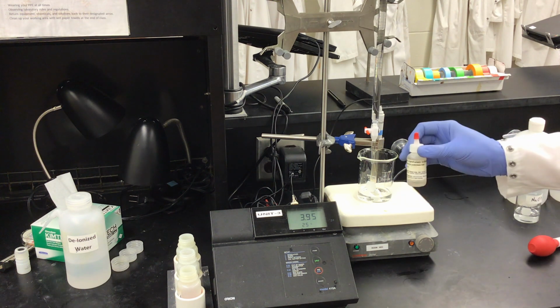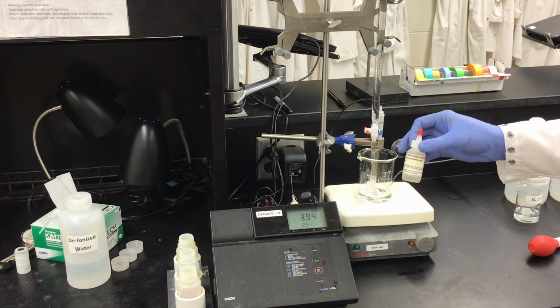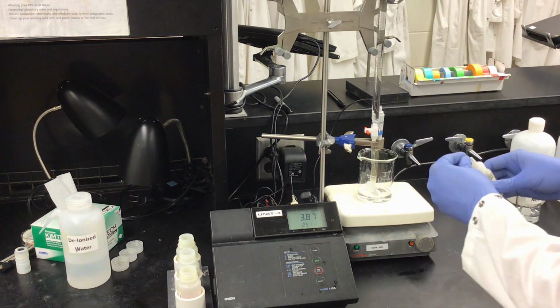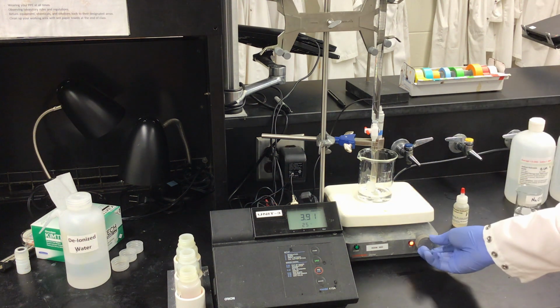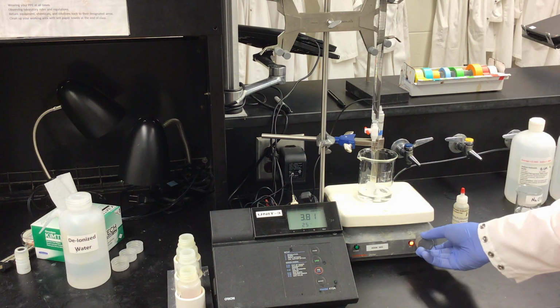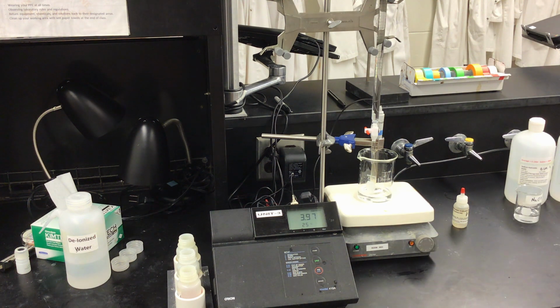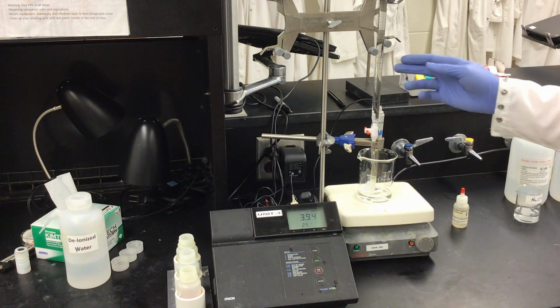Now I will add several drops of my phenolphthalein indicator. Our phenolphthalein indicator in the presence of acid does not have any form of a color. However, in the presence of base, it will start to turn pink. I will mix it into my solution slightly. And now that everything is set up, I can start my titration.